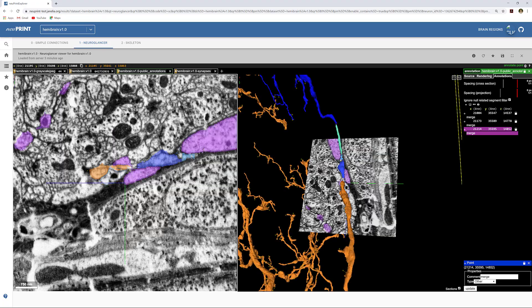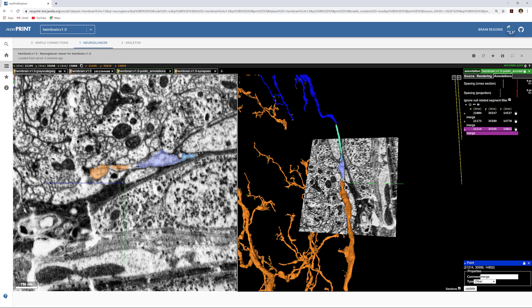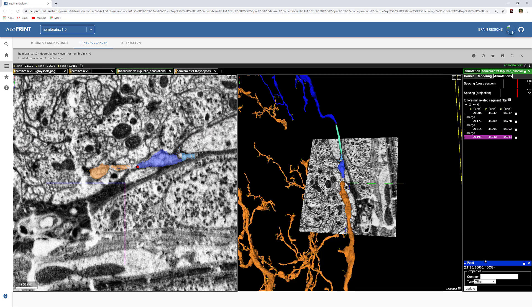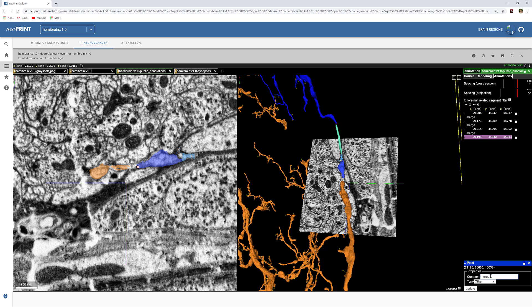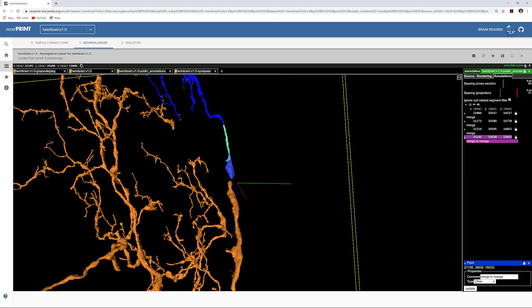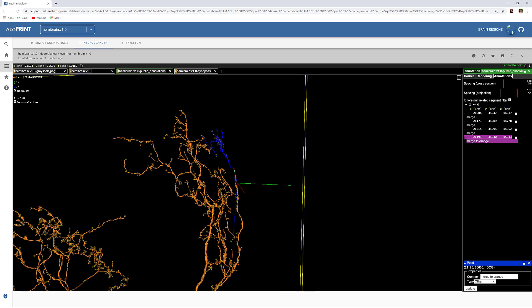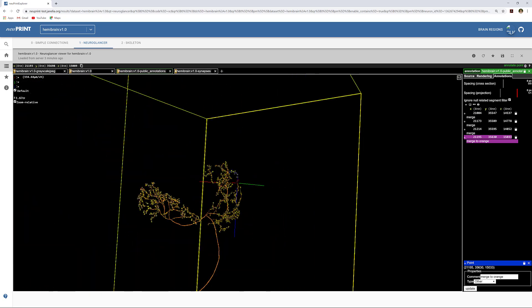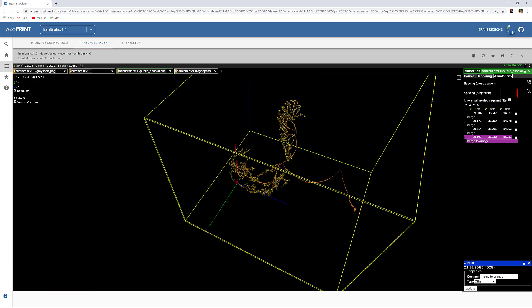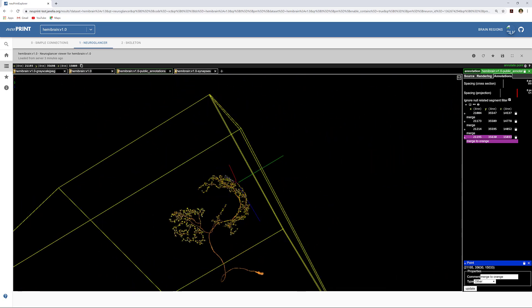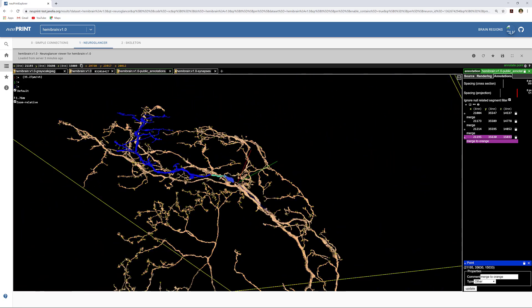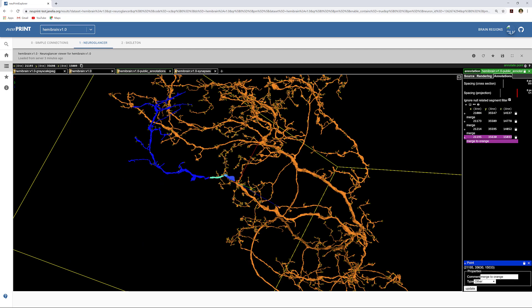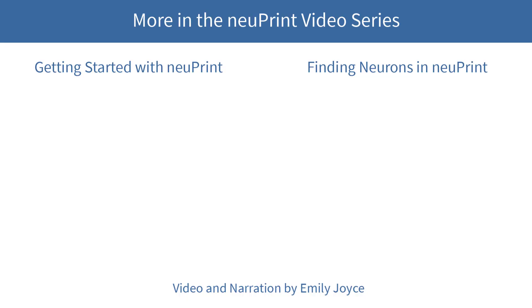We can place one final bookmark and specify which body we think it should be merged onto. Selecting this body shows that we have found the large neuron that our small assigned body belongs to. These bookmarks will be processed by Janelia within a week.